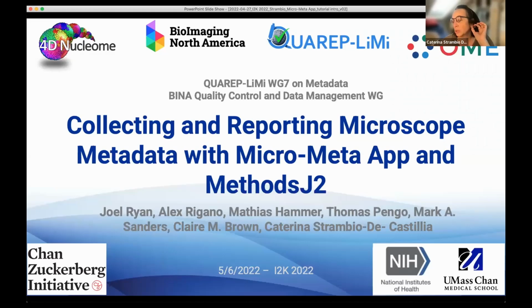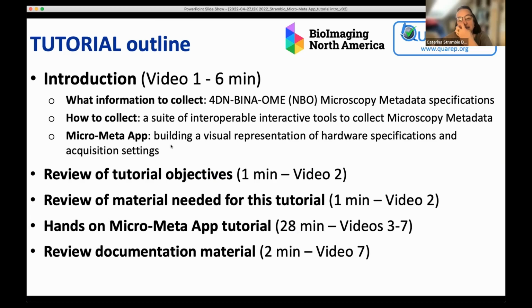Yeah, so I am going to quickly give you an overview of the tool. After you take part in this tutorial, there are a series of videos that go through similar things to what I'll tell you again. And so I'm just going to give you a little bit of an orientation about the videos.